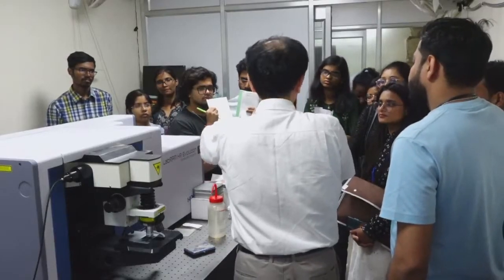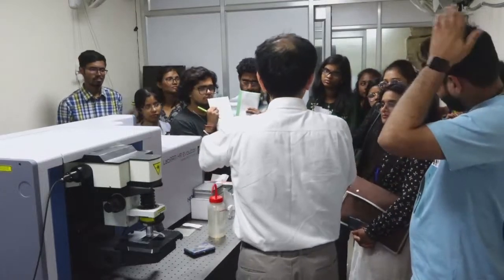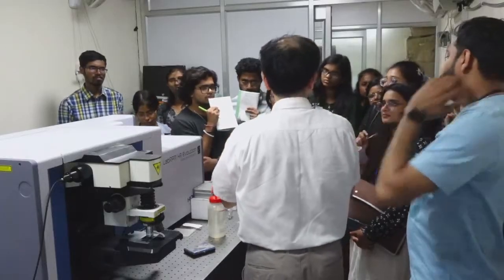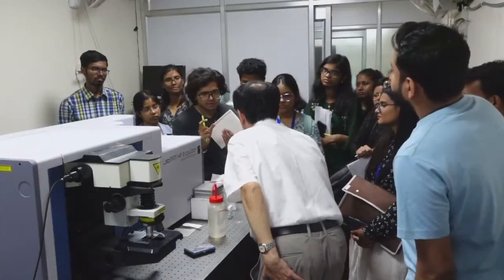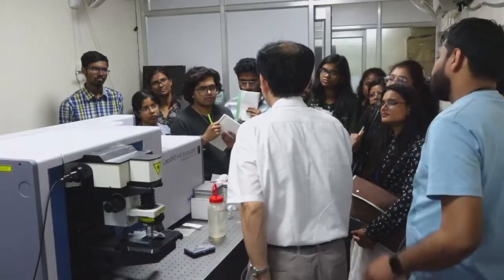It will take more time, right? Yes, and the CCD can do different areas simultaneously. So, what's the full form of CCD? Charge coupled device.